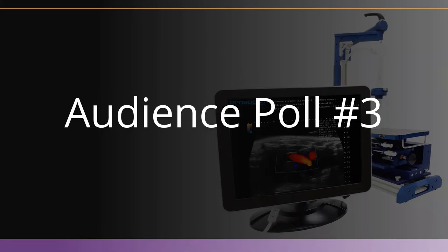And a reminder to everyone, we will begin our question and answer session momentarily. So please do submit as many questions as you like, and then we'll get started. Tanya, back over to you. Great, thanks, Martin. I'm just going to give everyone a couple more seconds to answer the poll question. I'm also going to use this time to look a little bit at the questions that have come through. So again, just a couple more seconds.